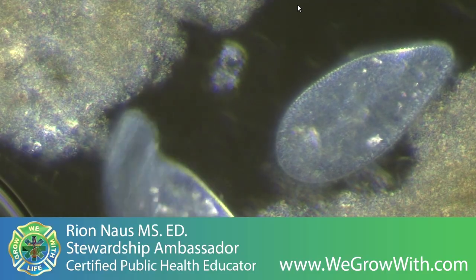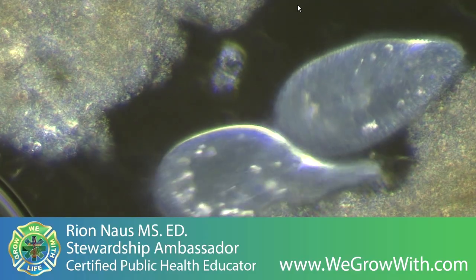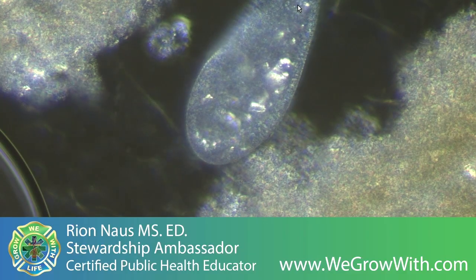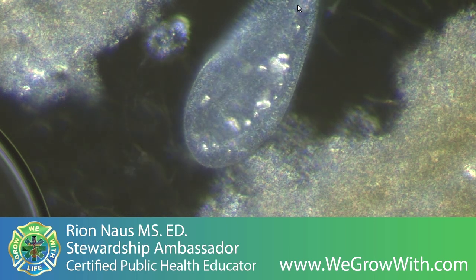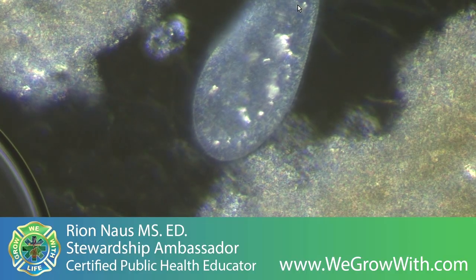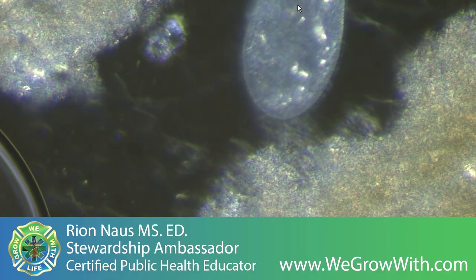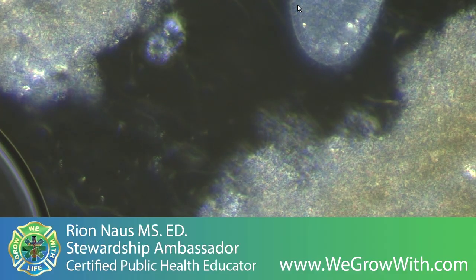Found in almost any watery environment. They range from free-living species like the paramecium. That is super cool. Usually you do not get such a sitting-still opportunity to look inside of these creatures, which were once described as a race car. But you can see that inner structure.